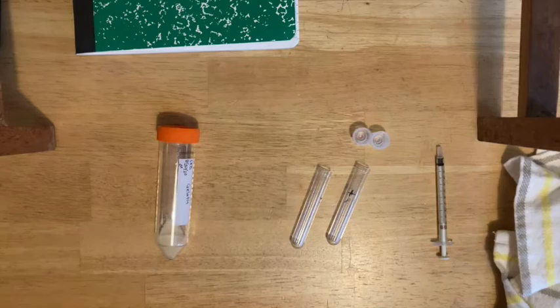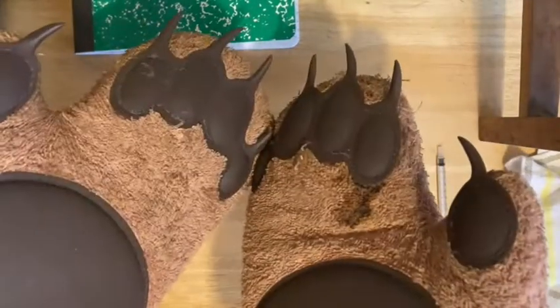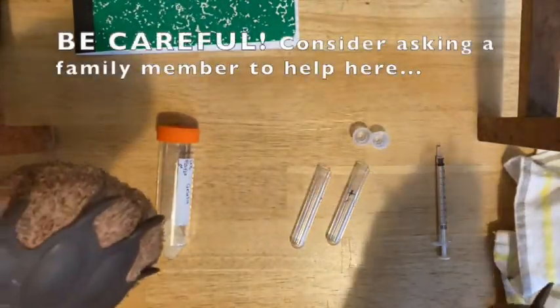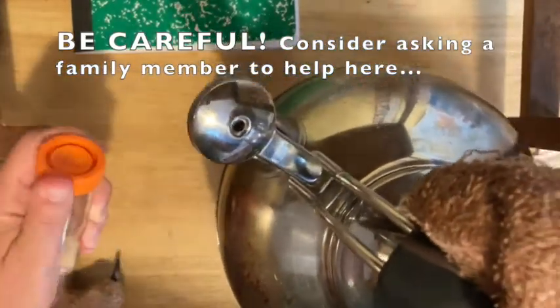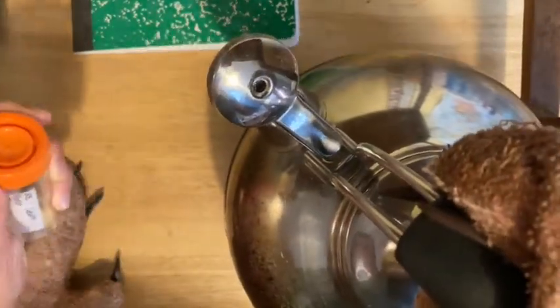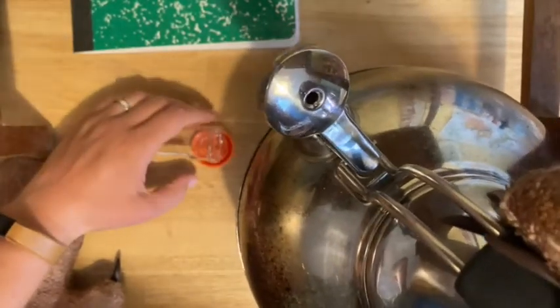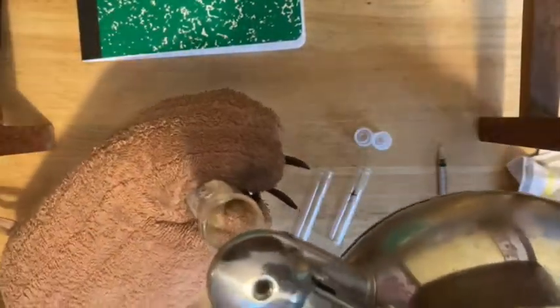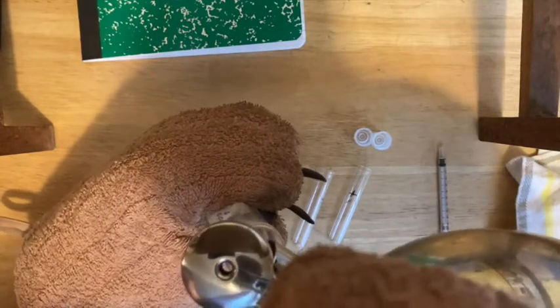Next, you're going to add some boiling water to your gelatin that you weighed out in the tube. You want to have some sort of heat protection for your hands, so pot holders. Make sure you're wearing your safety glasses. You may find this easier with a family member to help. Please be very careful that you don't get any boiling water on yourself. Follow the directions to fill this up to the final volume, checking your notebook for exact amounts.